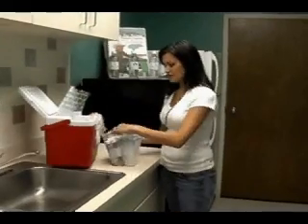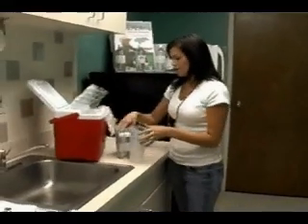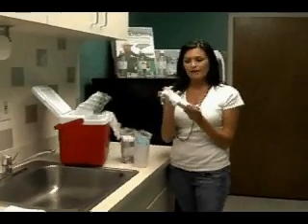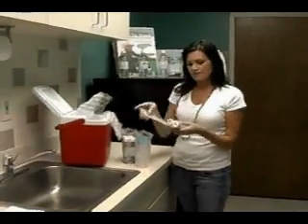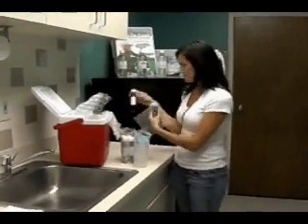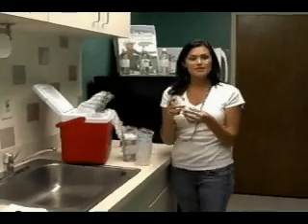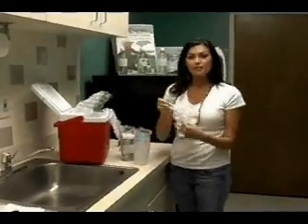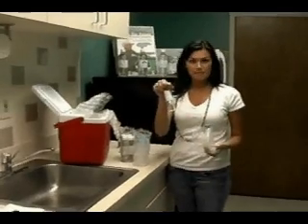You will also find two different types of bottles in the cooler. The first are HAA bottles, which are amber colored and have white caps. These bottles contain a small amount of ammonium chloride as a preservative. You will also find THM bottles. These are clear bottles with blue caps, and they also contain a small amount of a different type of preservative.